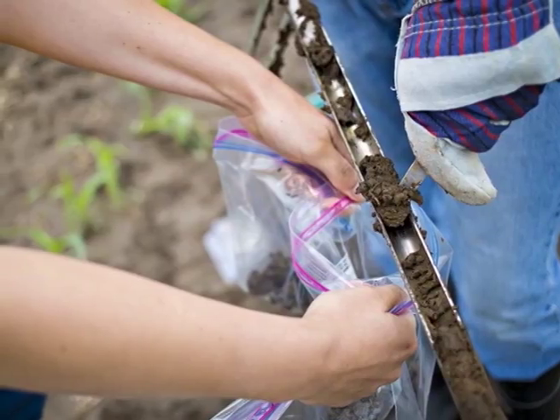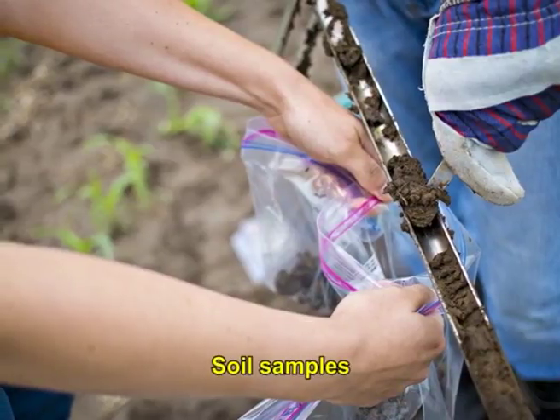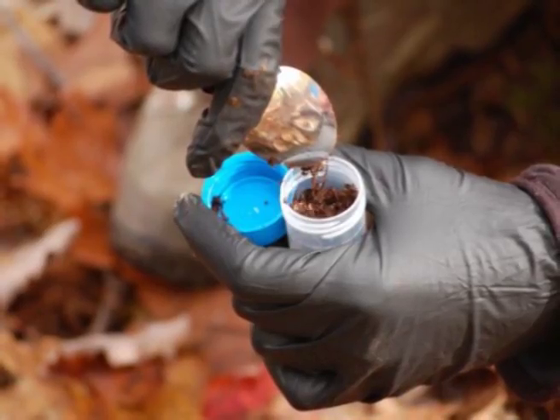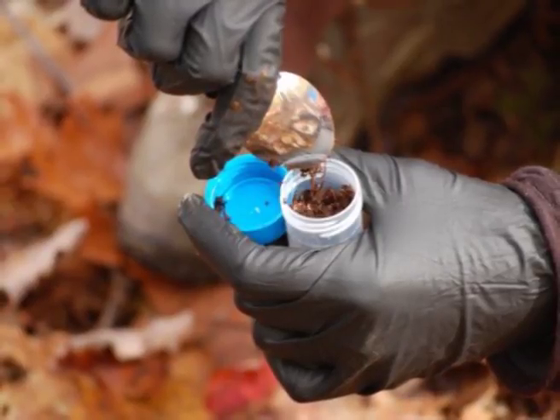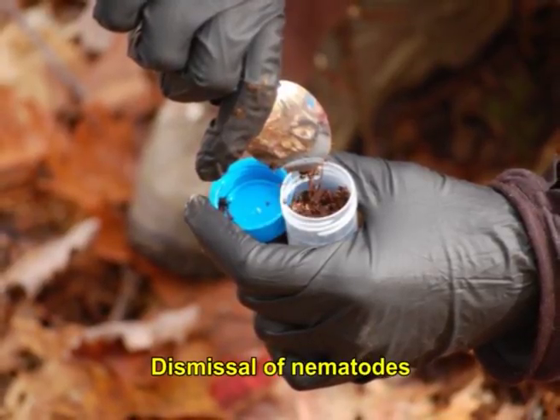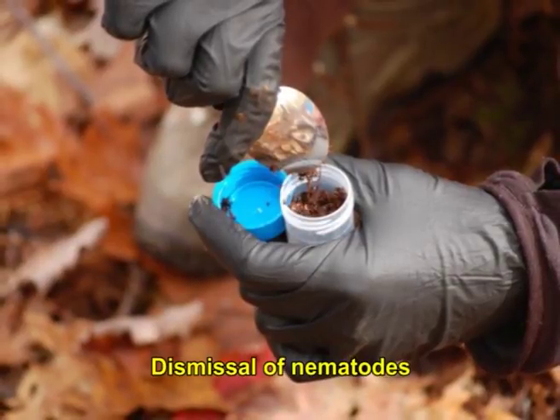Proper collection and processing of the soil samples goes a long way in accurately diagnosing the nematodes. Inappropriate collection and handling of the soil samples may result in the dismissal of nematodes. The proper guidelines should be followed while collecting samples for nematodes.